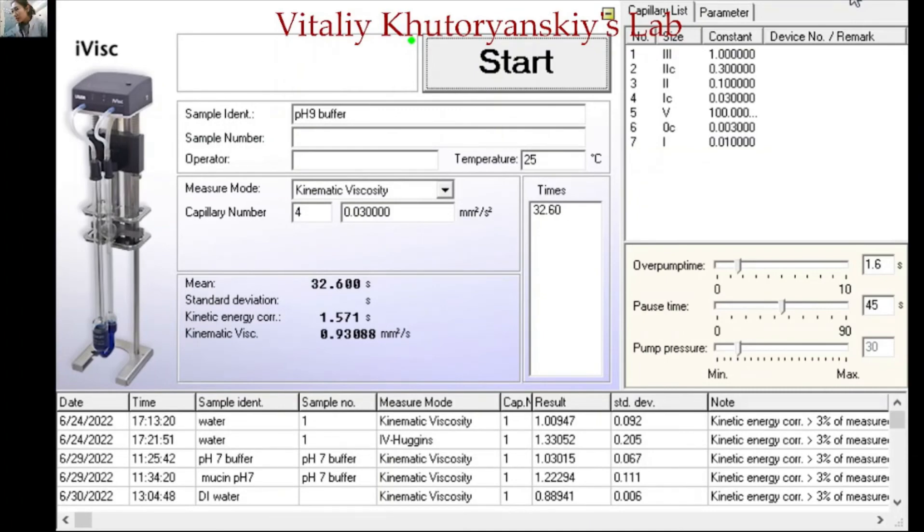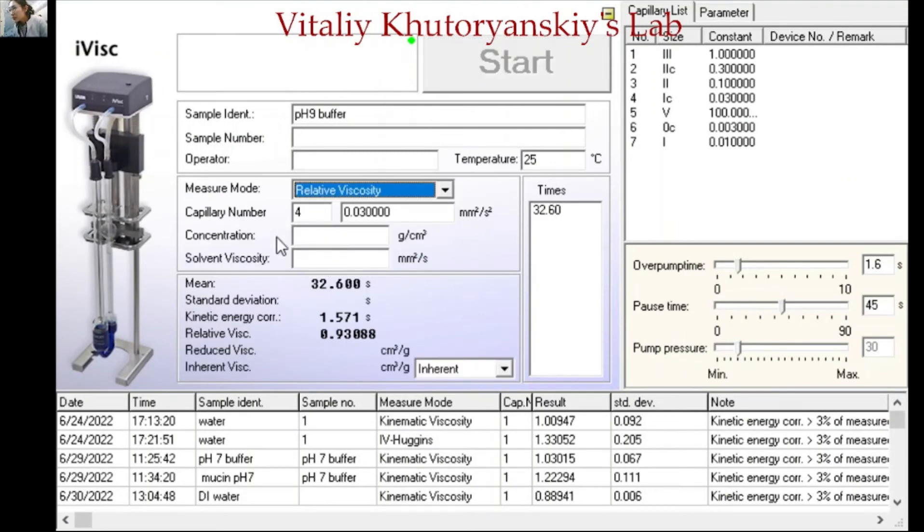After measuring the kinematic viscosity, we are going to measure the relative viscosity, which requires filling in more content. The concentration field is for the concentration of your solution — for my sample it is 1 milligram per milliliter, which converts to 0.001. For the solvent viscosity, it depends on the kinematic viscosity we just measured; from the results it is 0.98. Don't forget to change the model — it is set to Huggins. Once everything is set, click start.